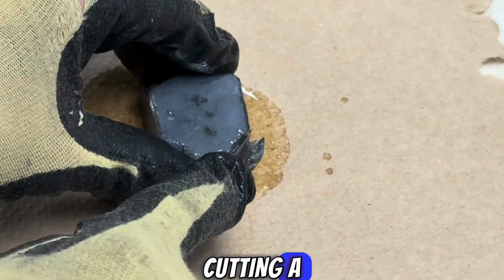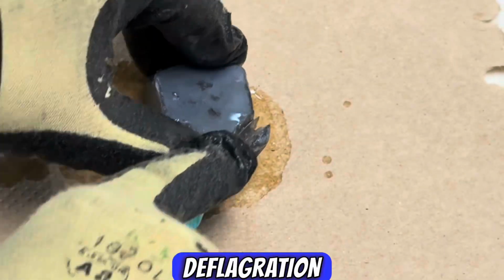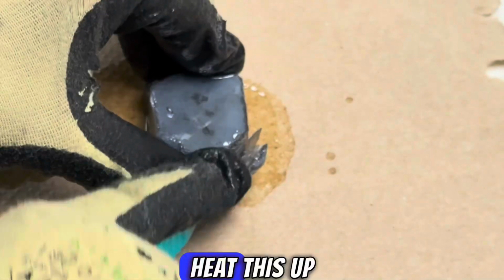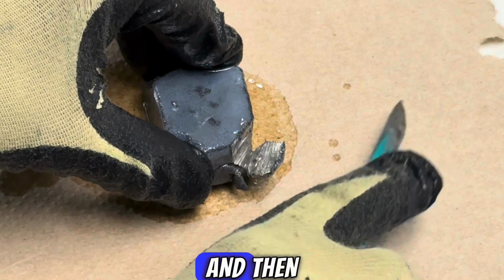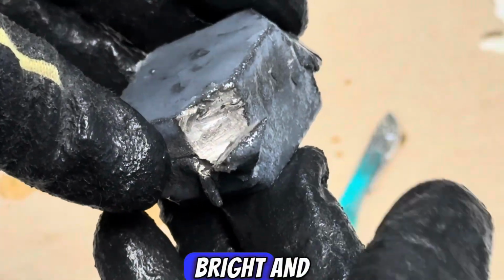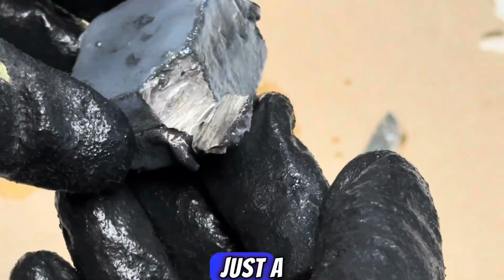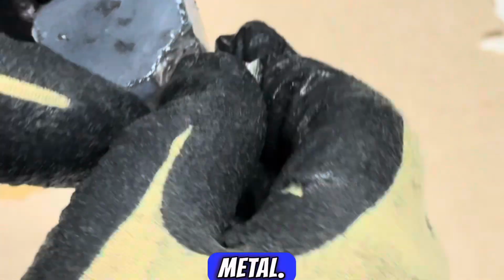Begin by cutting a small piece of lithium that you can fit on the end of your deflagration spoon. We'll heat this up with our blowtorch, and then we'll lower it into a vat of pure oxygen. Look how bright and shiny that luster is underneath the oxide layer. Just a beautiful alkali metal.